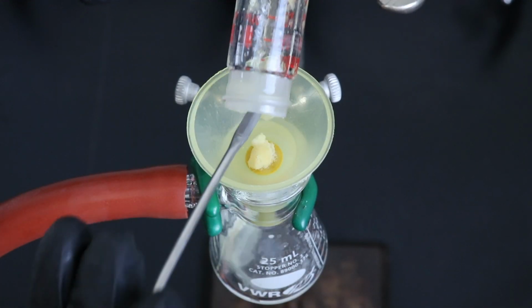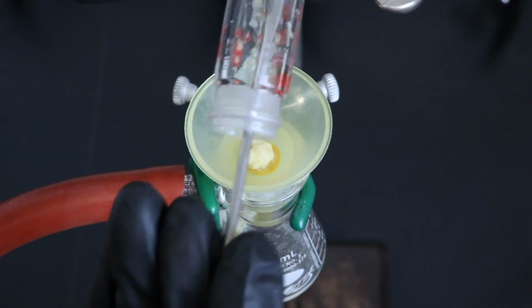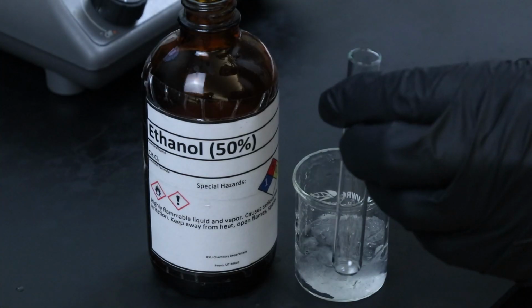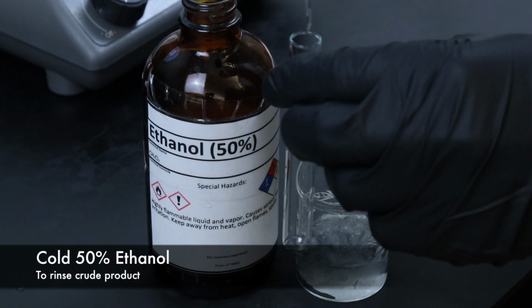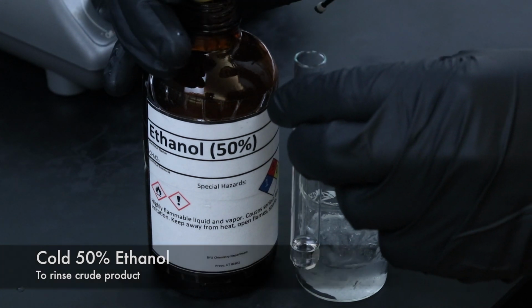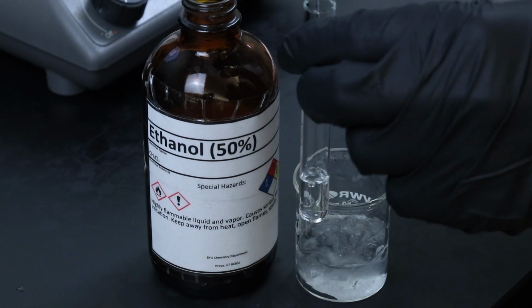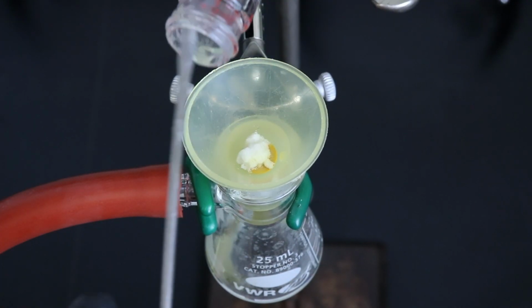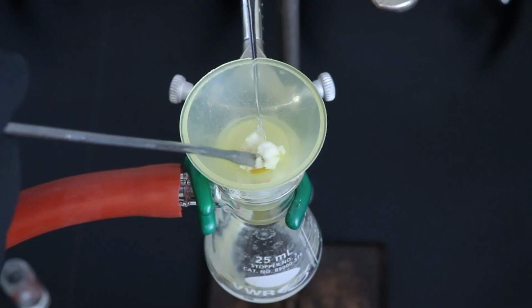The product can then be moved over to the Hirsch funnel to separate it from the solvent. And I'll be rinsing it with some cold 50% ethanol. I want it cold so that the product doesn't also dissolve and go through the funnel. So I'll place it in some ice and then rinse the conical vial with that ethanol and the product that remains as well.